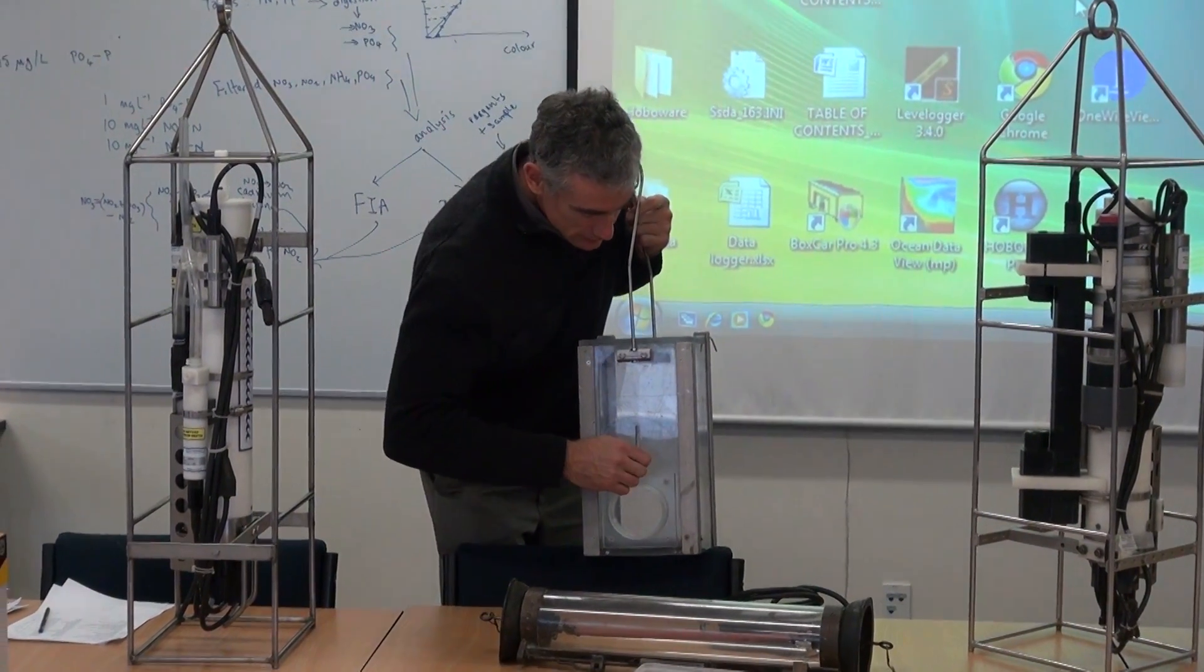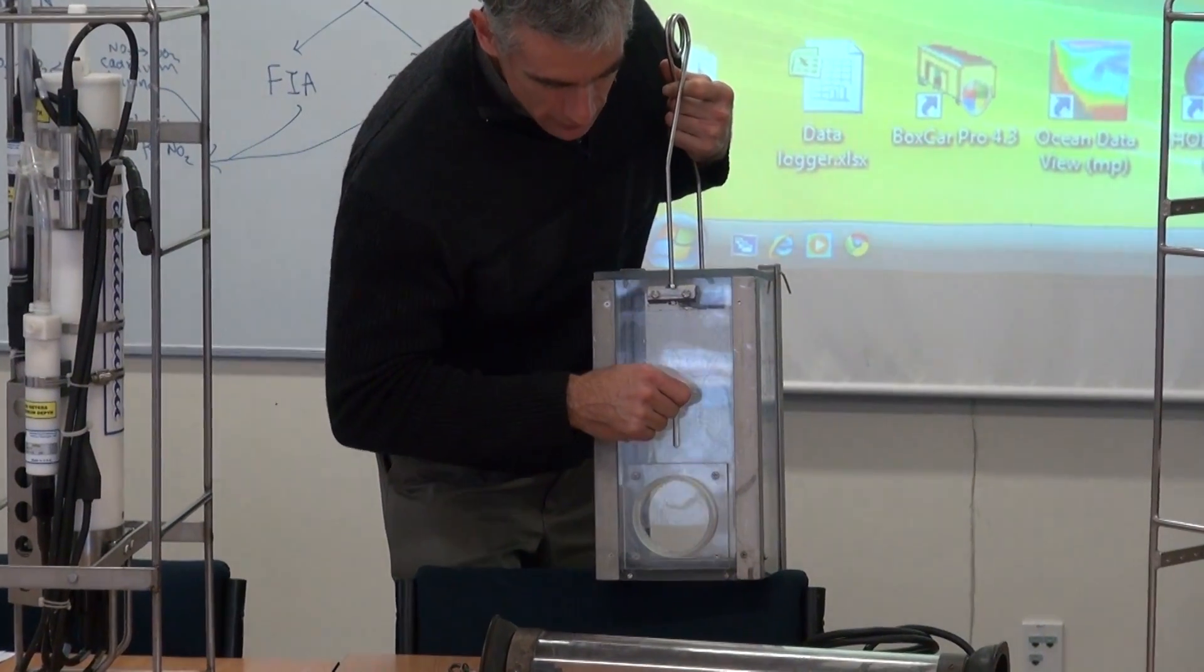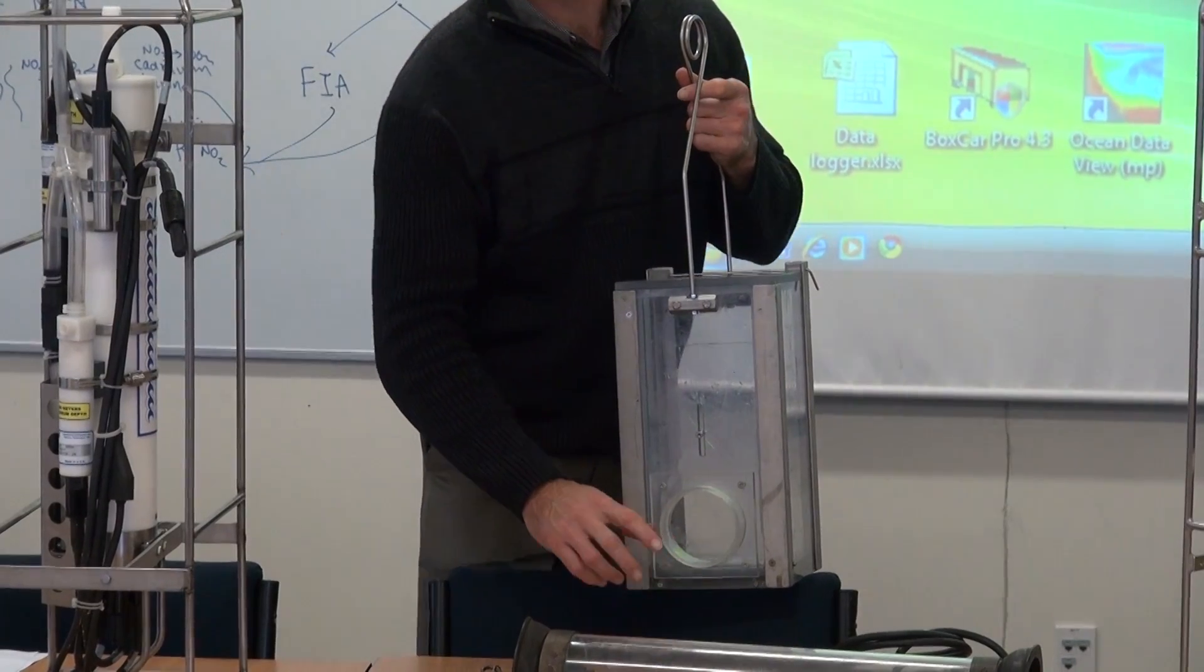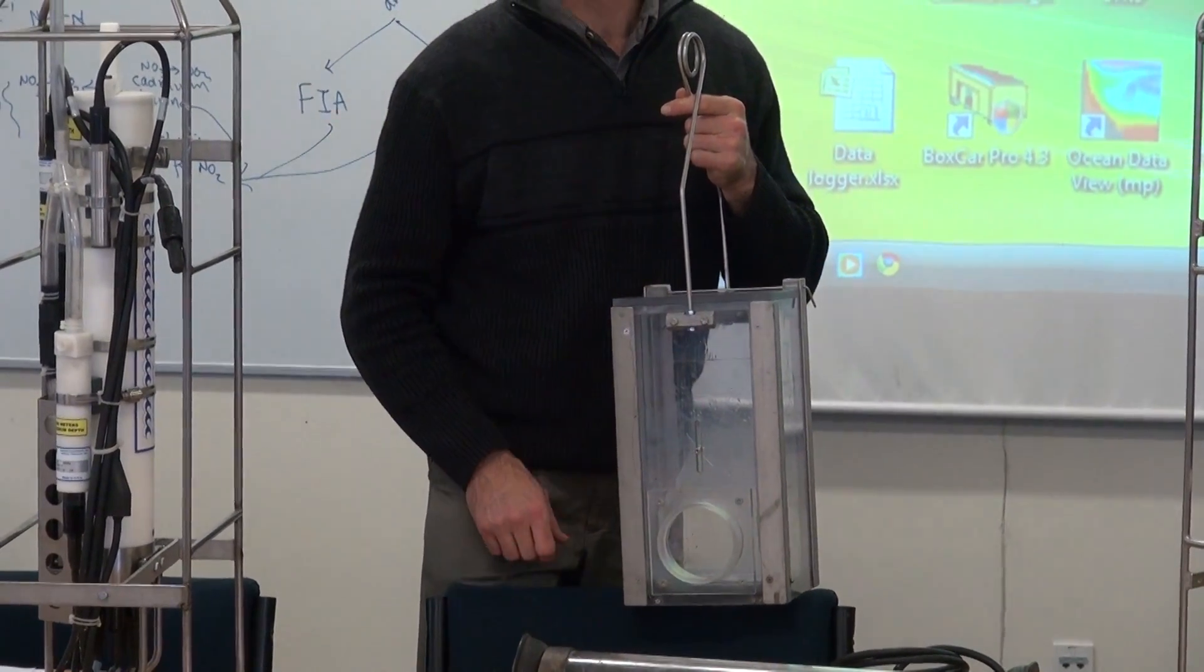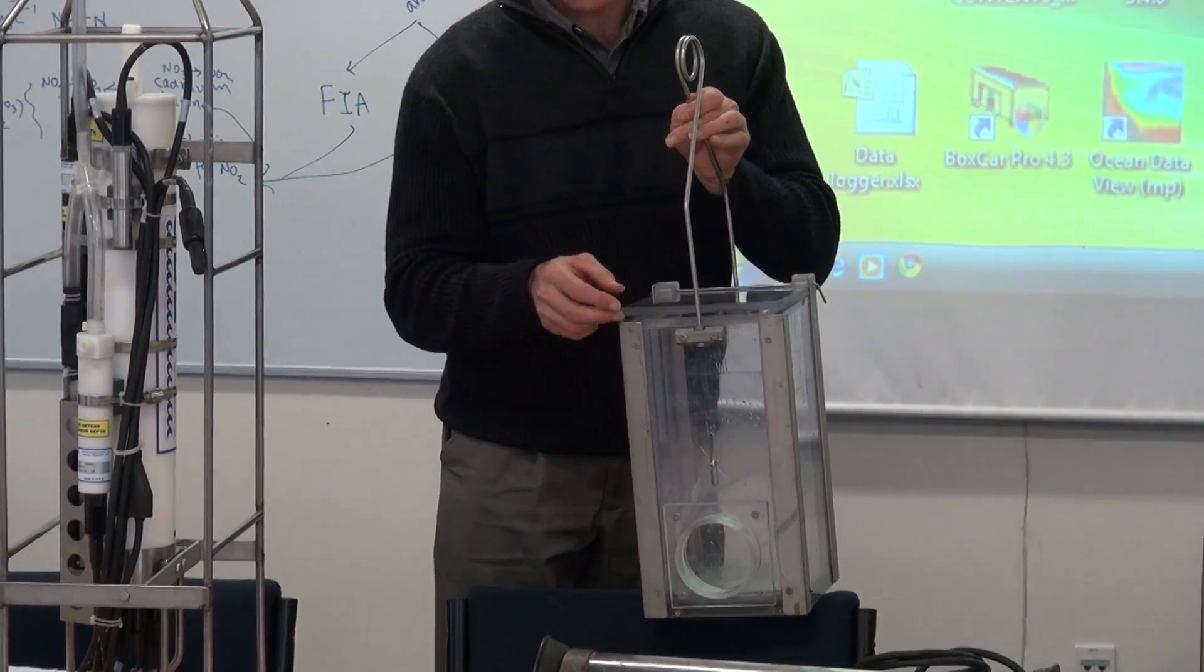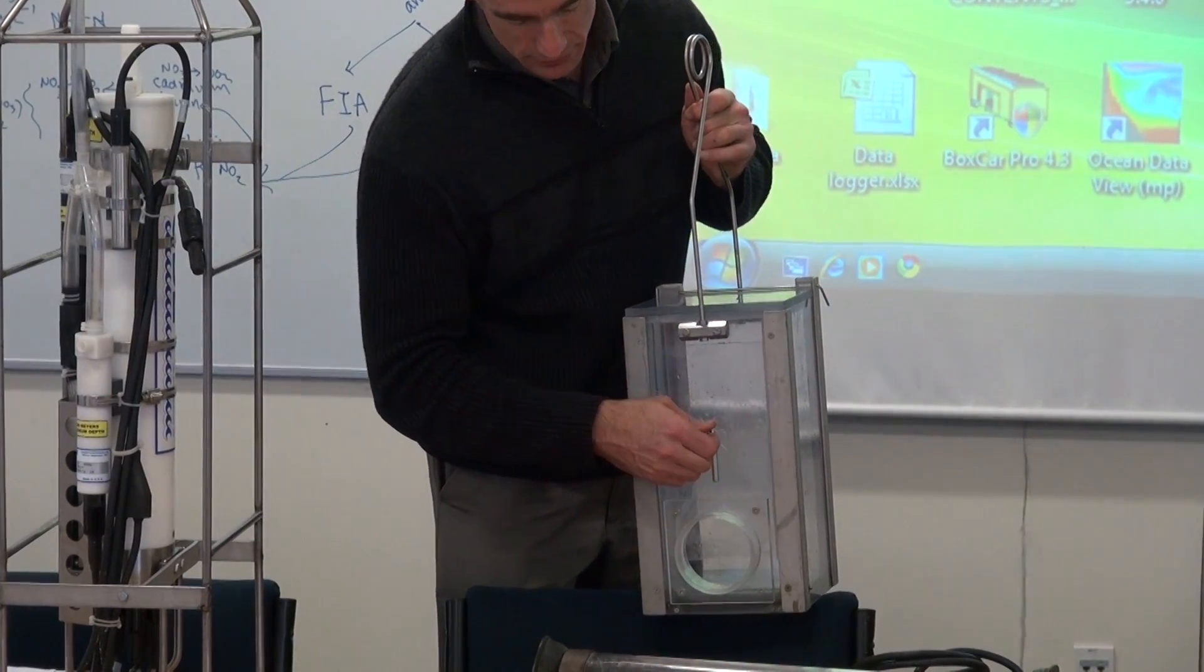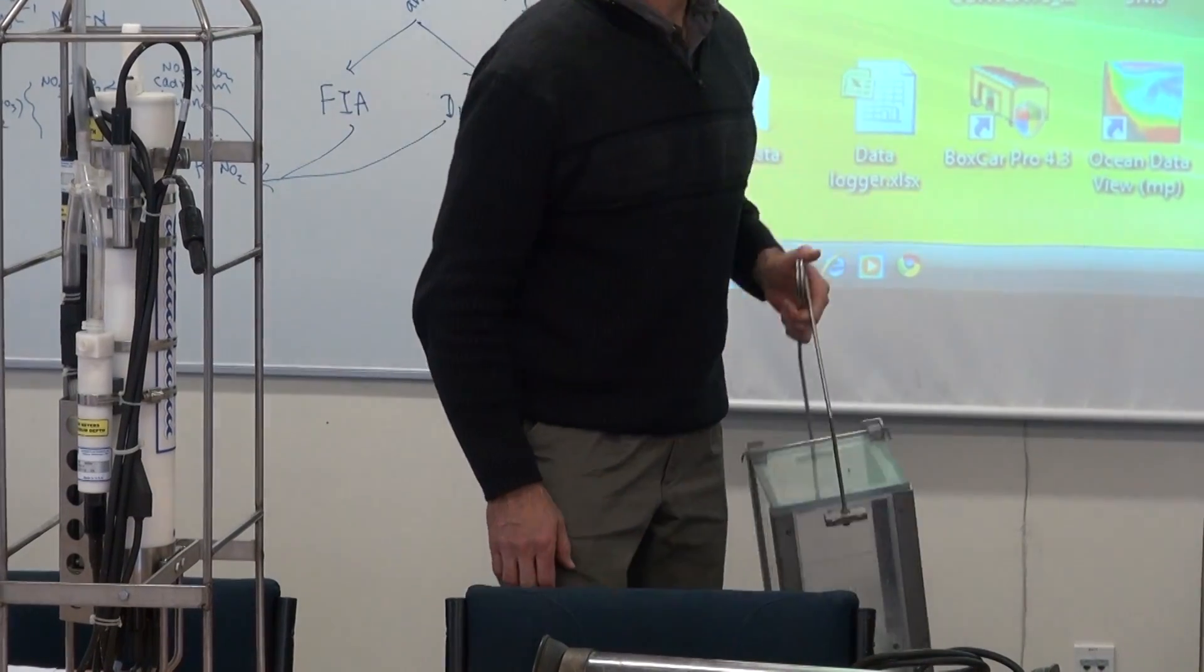And this little door here is what allows you to raise and lower that to be able to control the water going that you take your sample from. So, it's pretty neat. Well, the alternative is you can raise the trap door. I wouldn't recommend that necessarily. Probably better to be able to open this to control the water that comes out.